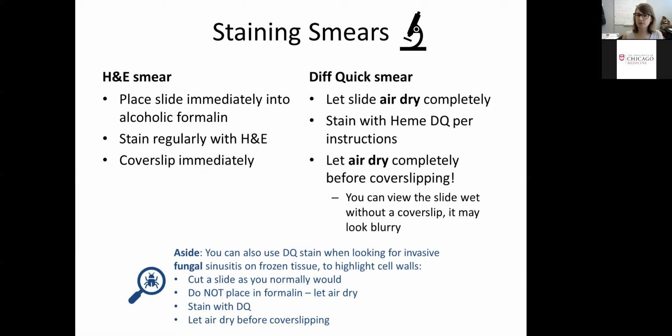As an aside, because we like to correlate things, right? You can also use that Diff Quick stain when looking for invasive fungal sinusitis on cut frozen tissue in order to highlight the fungal cell walls, all right? So this is how we would do it if we were doing it for fungus.